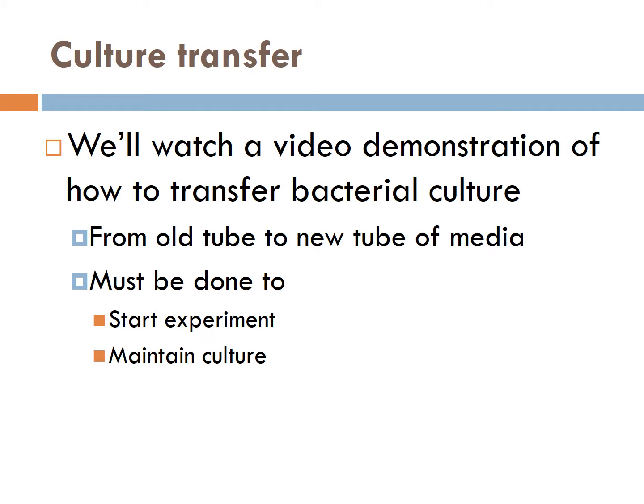In the last part of the lecture, we'll watch a video demonstration for how to transfer a bacterial culture from an old tube to a new tube of media. This is a routine part of anaerobic microbiology. It must be done when you want to start an experiment, and also, it must be done to simply maintain a culture. If a culture is not transferred every couple of weeks, it will lose viability.